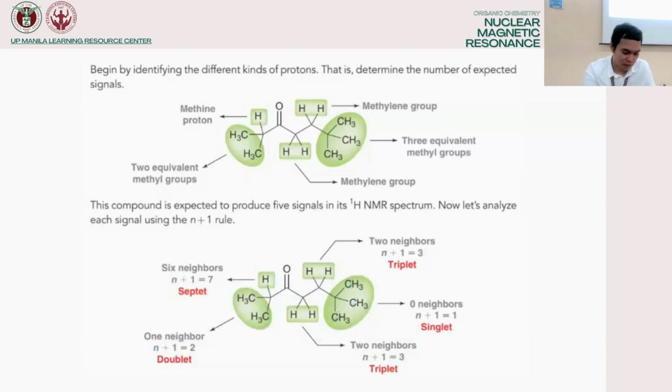Okay, tama. So, ganito yan. Bakit singlet siya? This is carbon 1, carbon 2, carbon 3. Malayo na siya. So you have to check the carbon. That is carbon 1. Diyan ka mag-start. Unlike this one, bakit ito na-consider niya pa na neighbor?